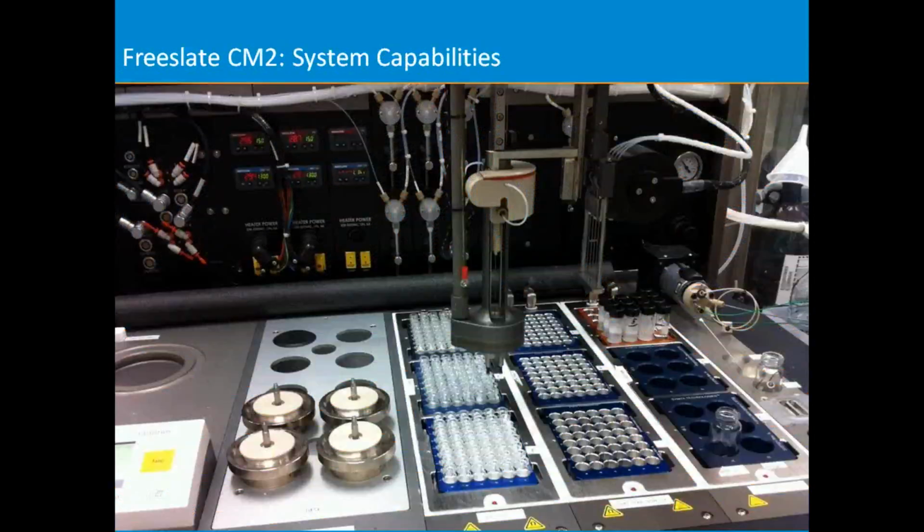I'm going to start today by giving an introduction to the Freeslate Core Module 2 and its system capabilities. You'll notice on the back left is a circular hole. This is actually the entrance to the balance that's on deck. So unlike systems where gravimetric dosing is done by difference, where only the bottle of reagent is weighed, here we actually move vials to a balance and weigh into them.